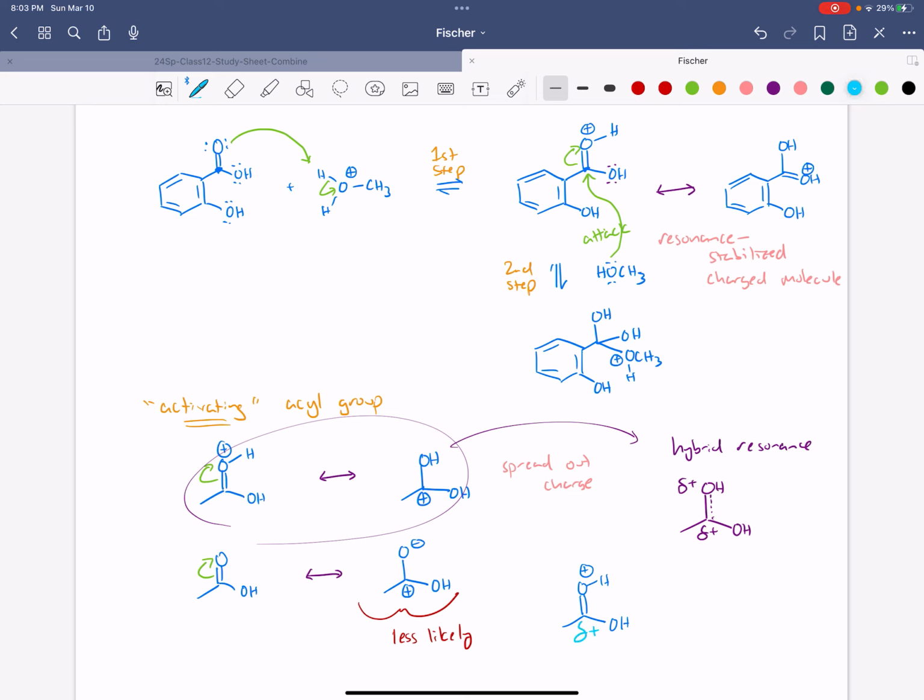Okay, with an acid-base extraction, you have organic and aqueous. And let me put those 2 situations here. This should look very familiar. This was in your lab 3 post-lab, organic and aqueous. I'm going to talk mainly in generalities, but then I think we'll have time to look at some specific cases, or at least one specific case. Aqueous, okay, agua, water-based. So when you have 2 layers in the extraction, you have the immiscible organic layer and aqueous layer.